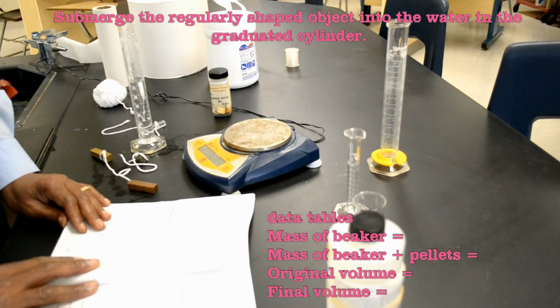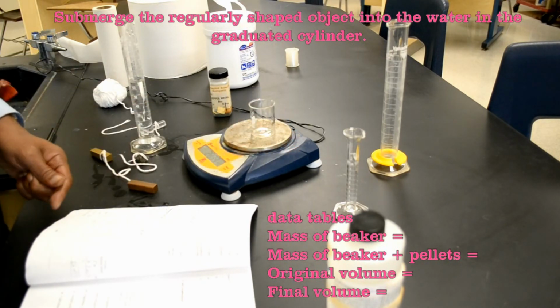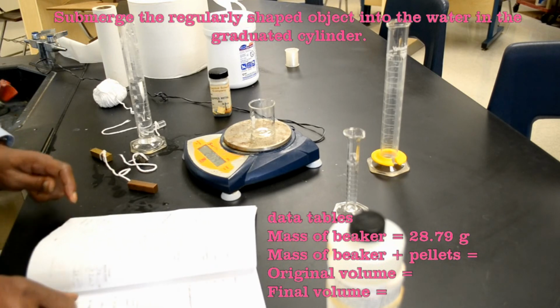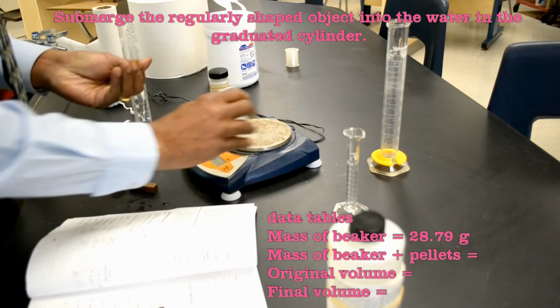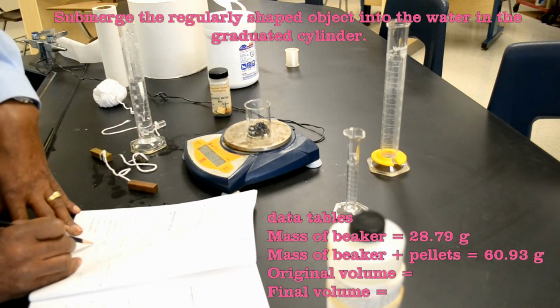Measure and record the mass of a 50 mL beaker. Okay, so that's a 50 mL beaker. The mass of the 50 mL beaker is 28.79. It says add 50 pellets to the beaker. Measure and record the mass of the combined pellets in the beaker. So the mass of the beaker plus the pellets is 60.93.